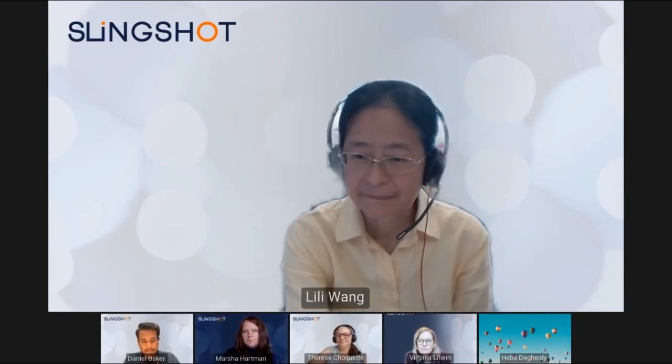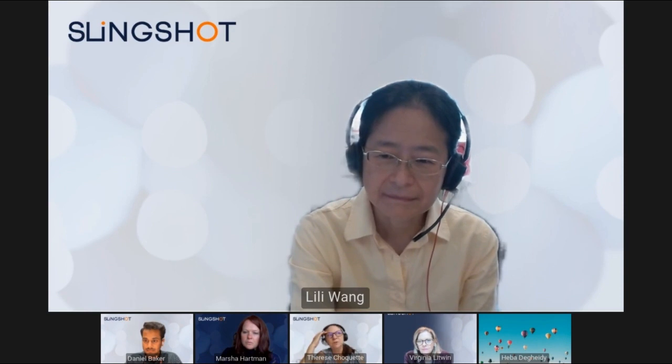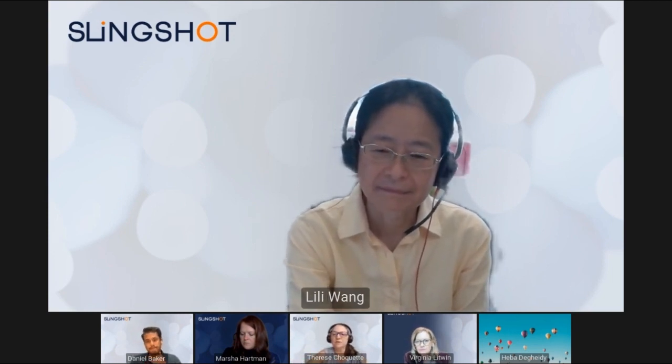And Therese? Yeah, thanks, Daniel. That's a very good summary. I think it's very important to be sure that what you measure is the true measurement, that it's the right measurement. If I would measure my sample the next day or 5 days later, am I going to get the same result?